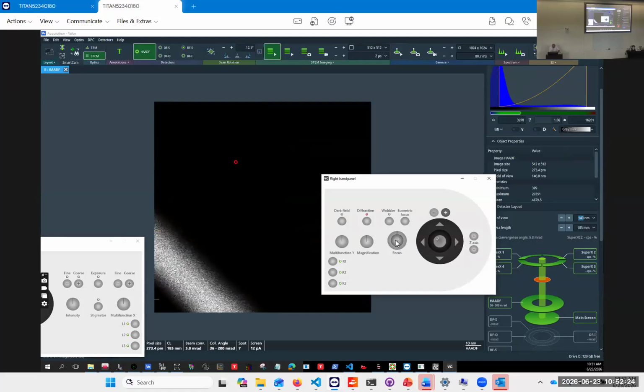Let's look. Like I know which directions it goes here. Seem to be doing a lot. It's too much already.